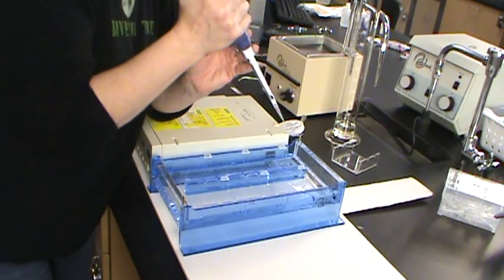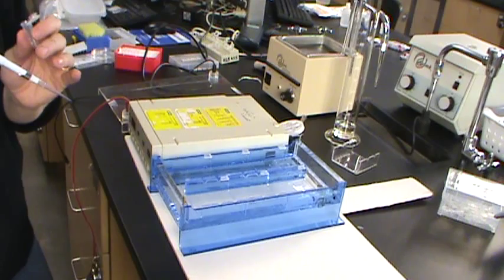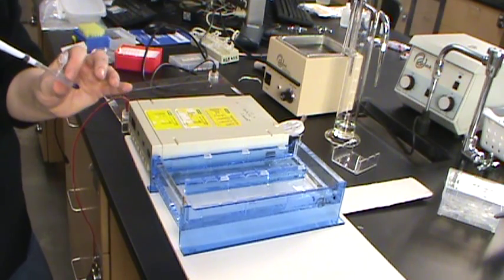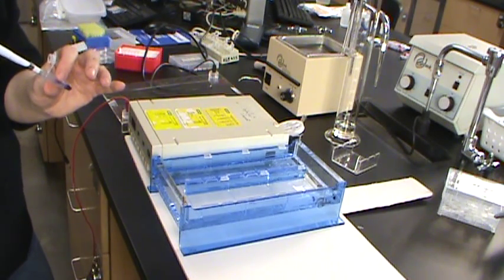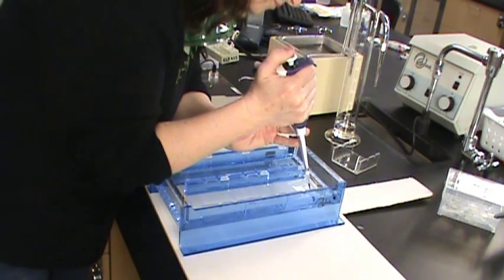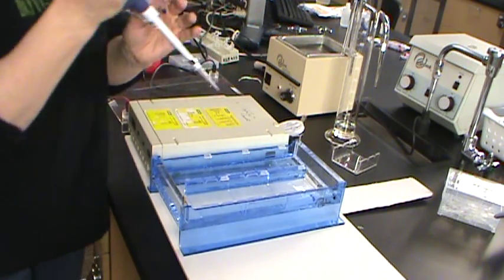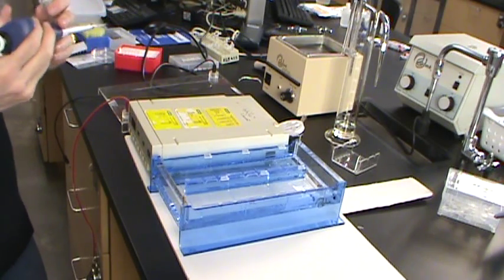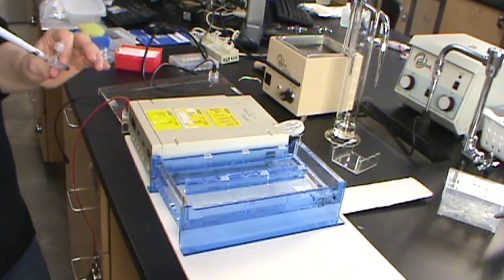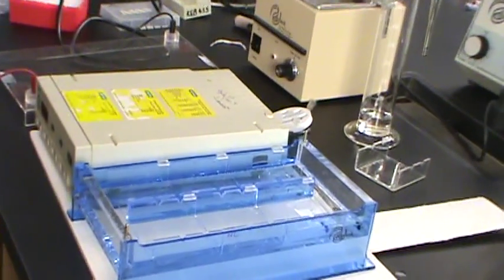And the important thing when you're pipetting this is don't let that plunger up until you have removed that sample from the well. Otherwise, you're going to blow bubbles in there. So you want your sample to go into the well, but not puncture the gel.